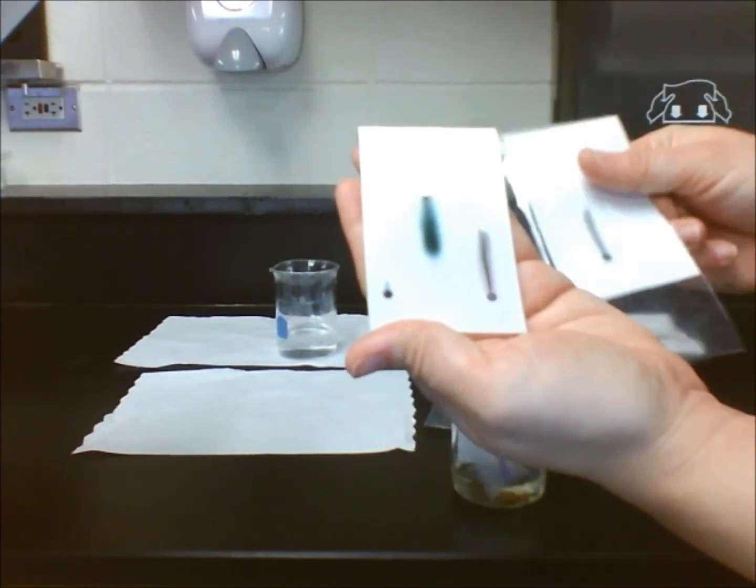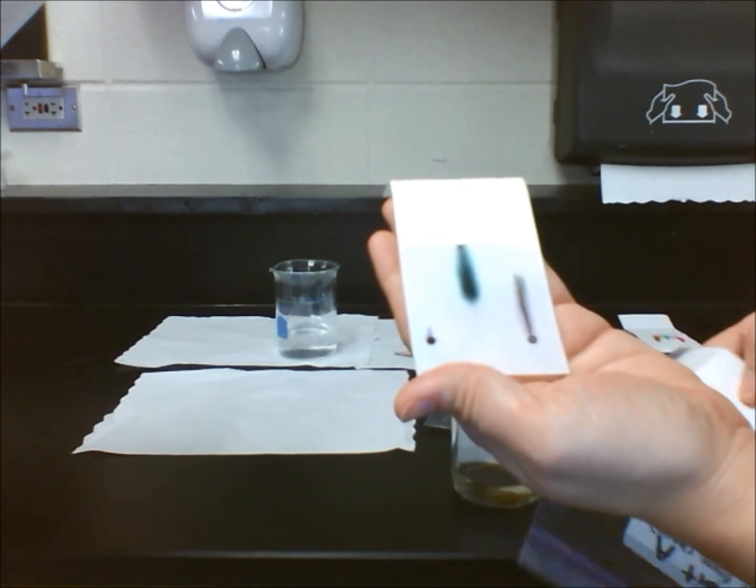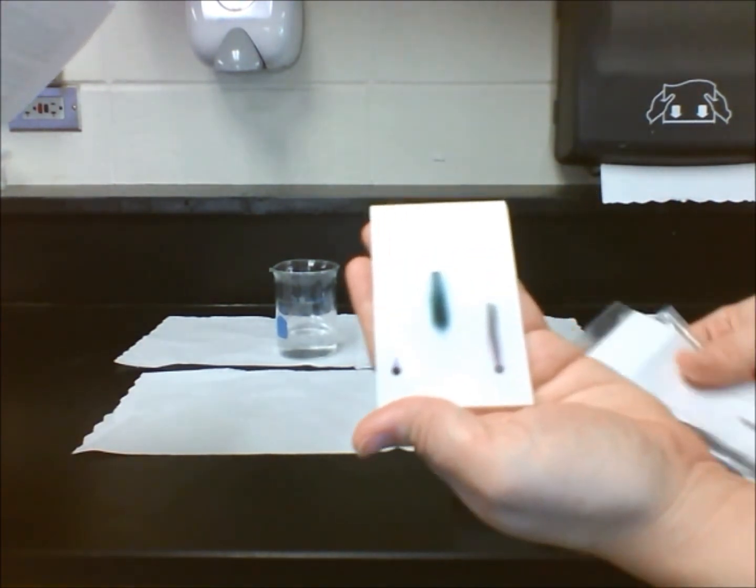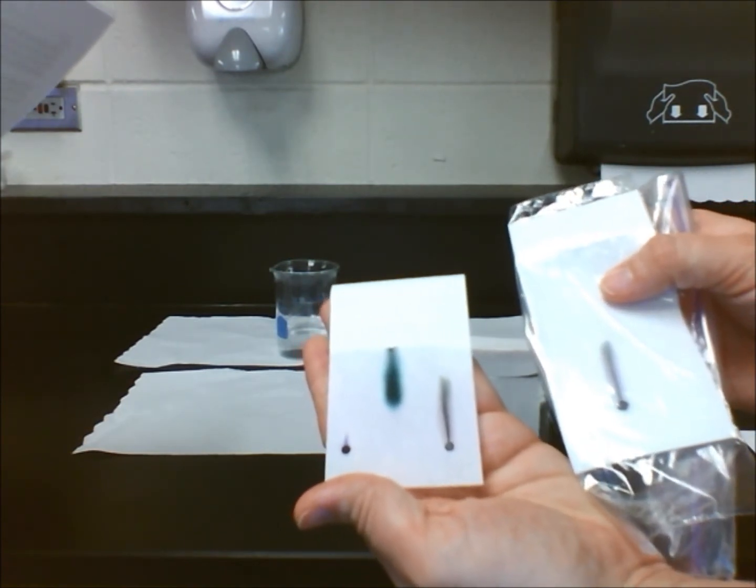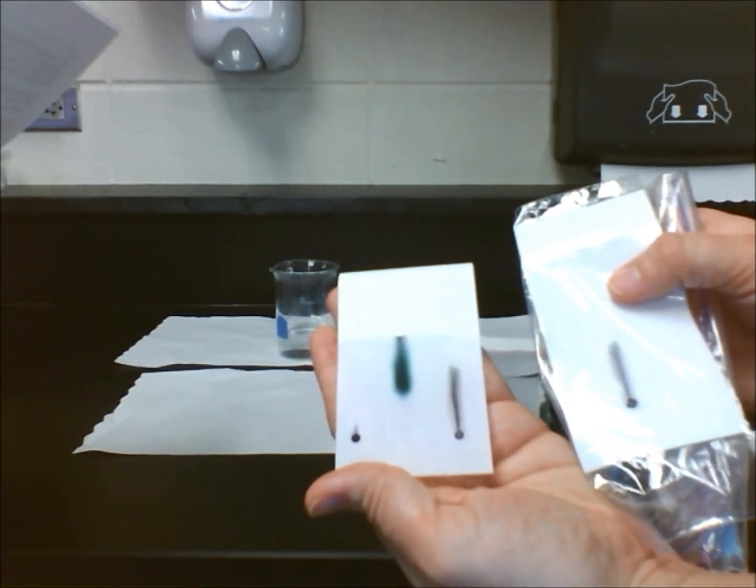When we compare Exhibit A to our test results, we can confidently conclude that the person who wrote the check is the bank teller. Her pen's chromatogram is almost identical to Exhibit A, with similar color solutes and the same dissolving pattern.